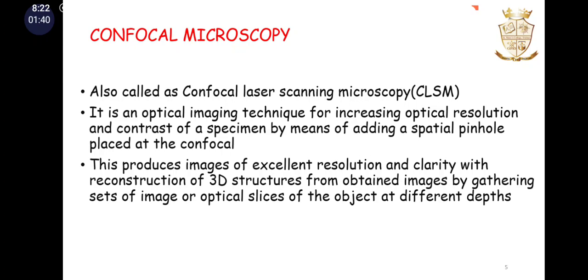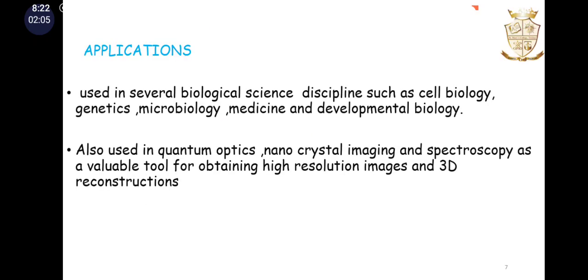This produces excellent resolution and clarity, with reconstruction of three-dimensional structures from images obtained by gathering sets of images or optical slices of the object at different depths. This is the diagrammatic representation of a confocal microscope, and these are the confocal pinholes, and there is a beam splitter, objective lens, and a detector.